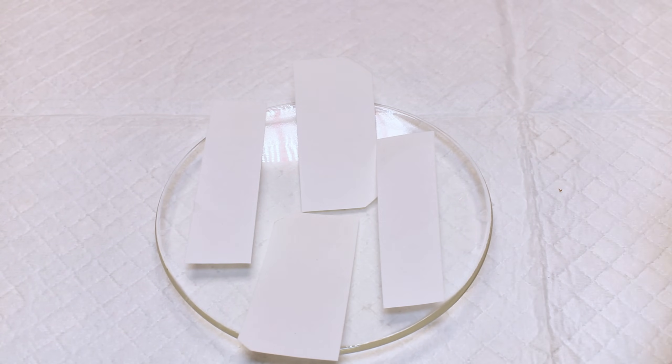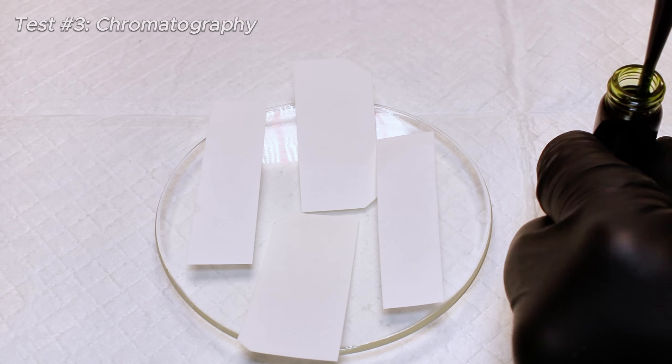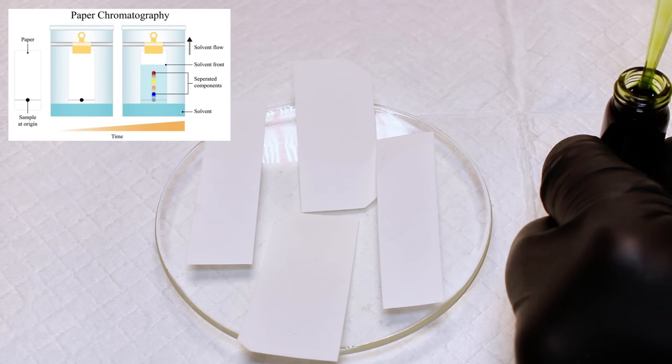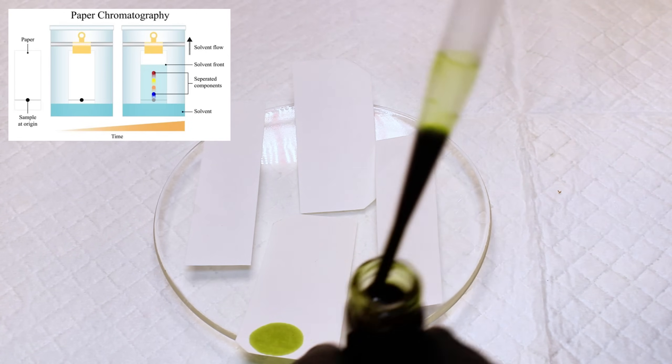So that was fun, but now I wanted to do another test to get a better feel for the solubility of chlorophylls in different organic solvents. To this end, I decided to do a basic paper chromatography test, which is something I do from time to time, but realized I've never actually demonstrated on this channel.